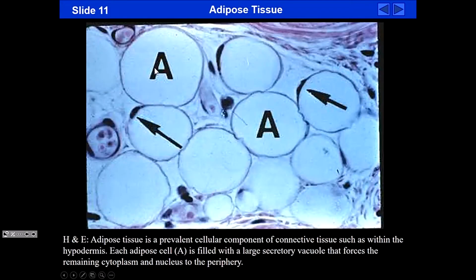Okay, adipocytes, fat cells. So this would be a unilocular adipocyte, i.e. a single large lipid droplet that fills the entire cytoplasm. The cytoplasm is squeezed to the periphery here. Here's the nucleus, here's a bit of cytoplasm, okay, which would include the plasma membrane, but you wouldn't see a plasma membrane that thick in a light microscopic view. But the lipid droplet is so large, it fills the entire cytoplasm. Any questions?